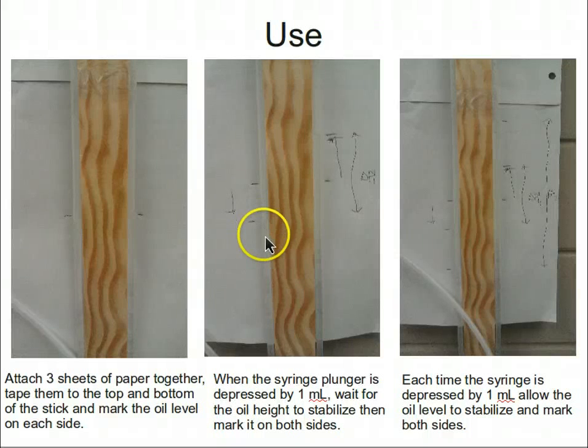For each volume change — each change in plunger position — the oil level should be marked on the paper, as shown here and here.